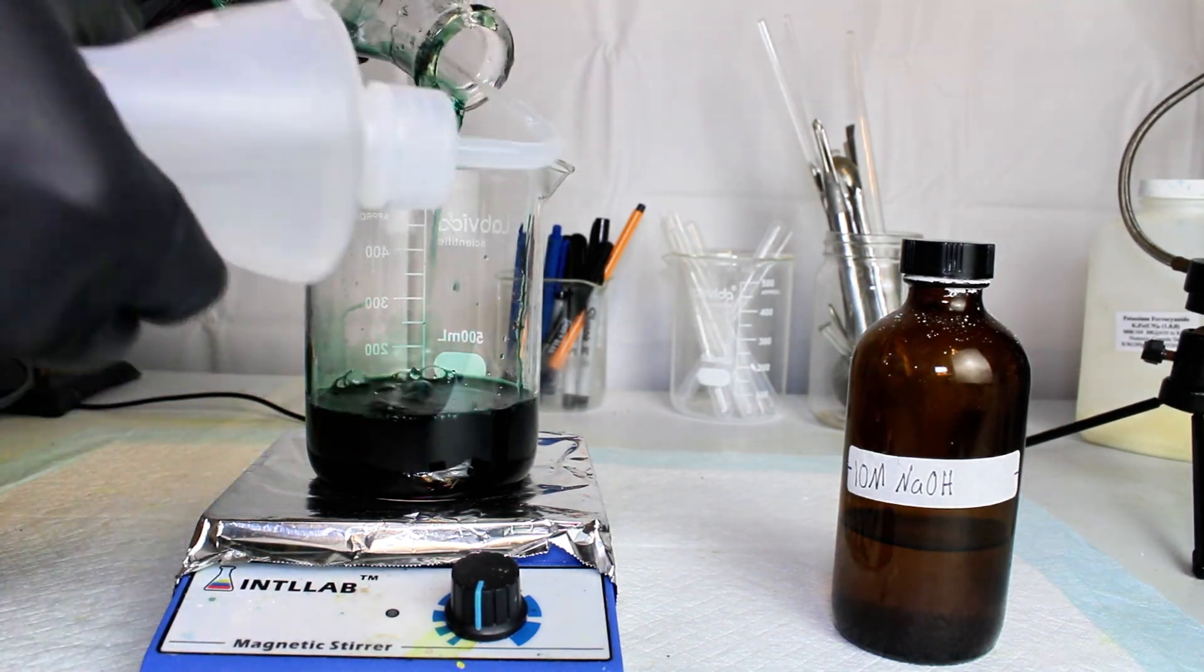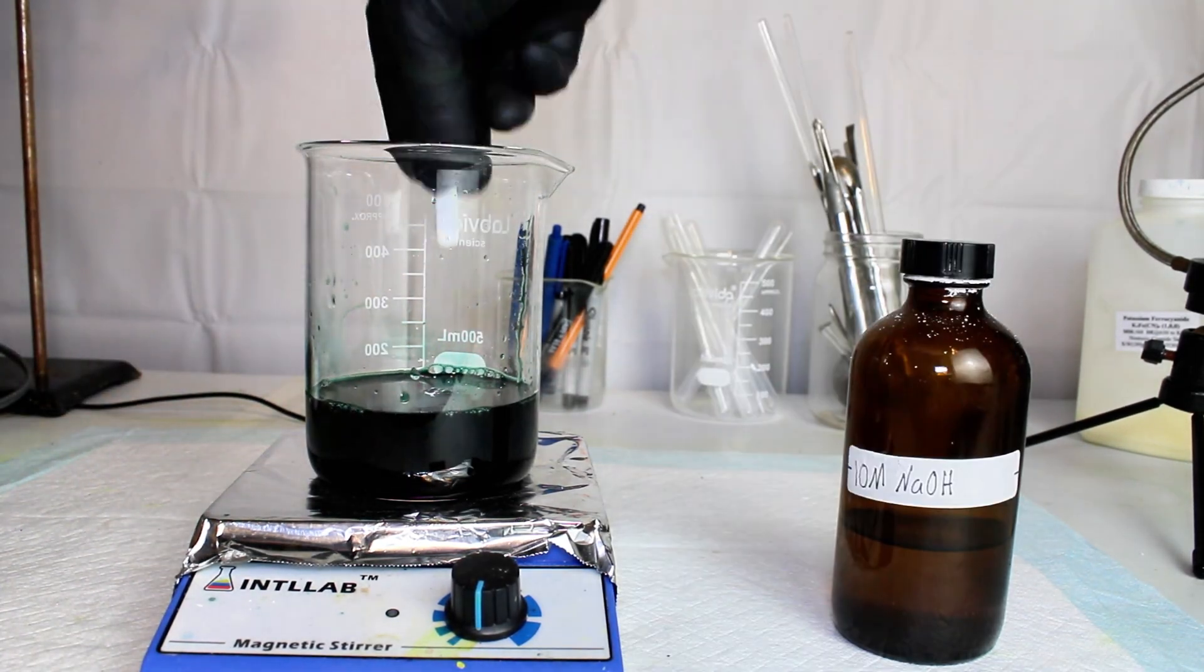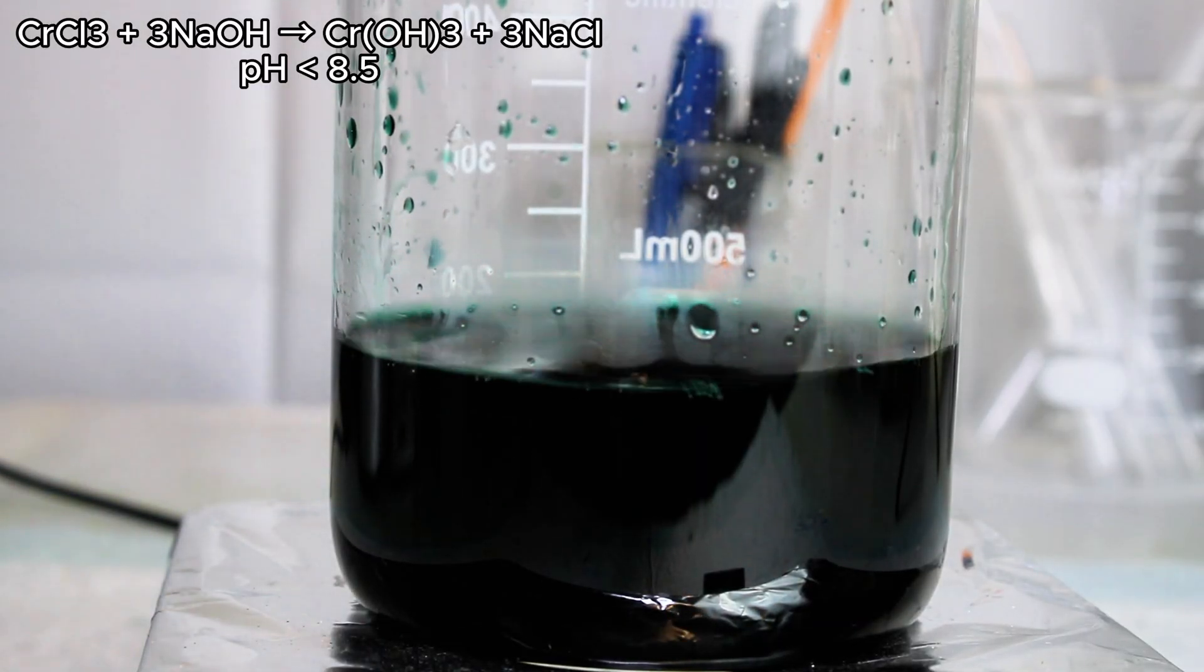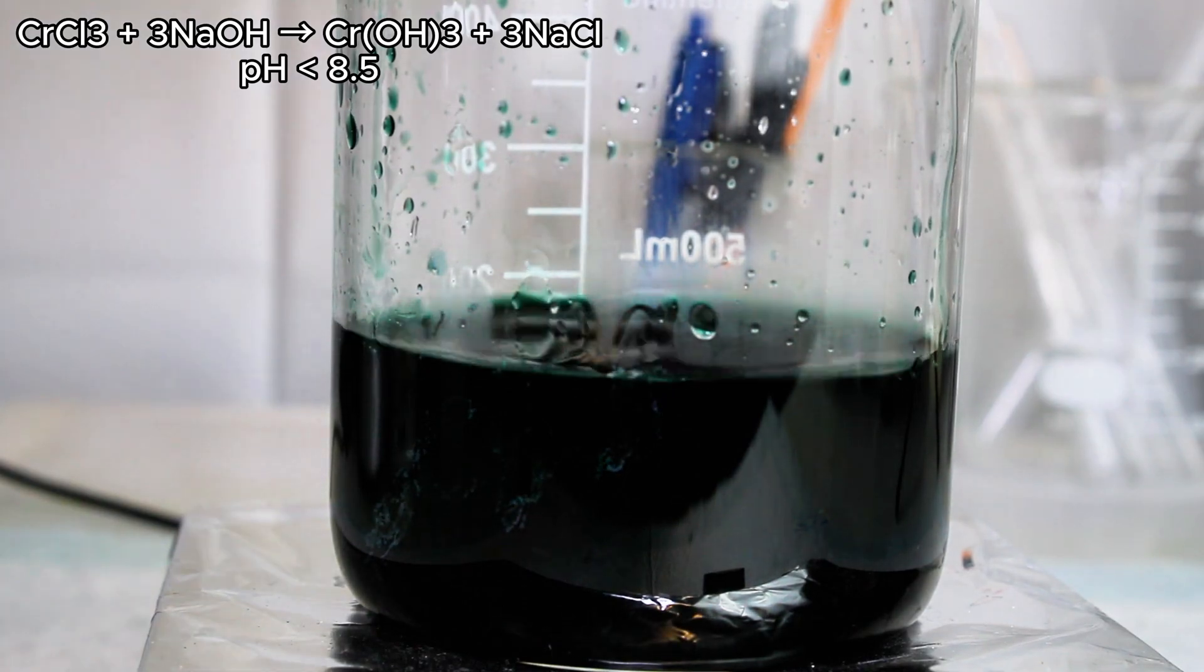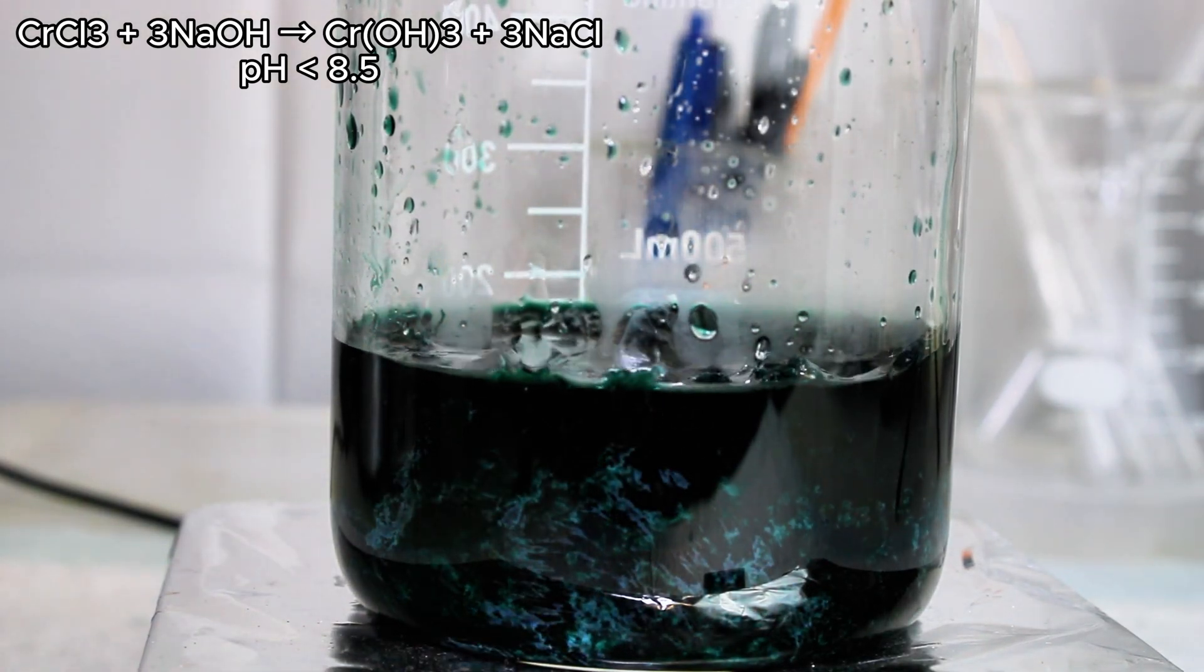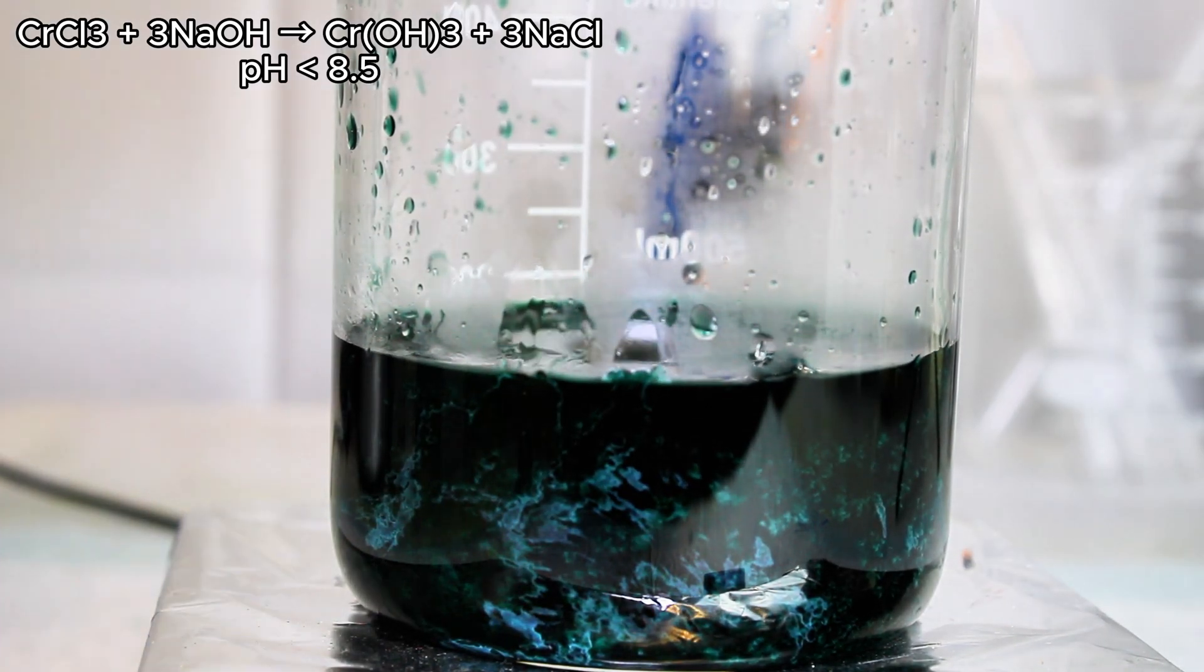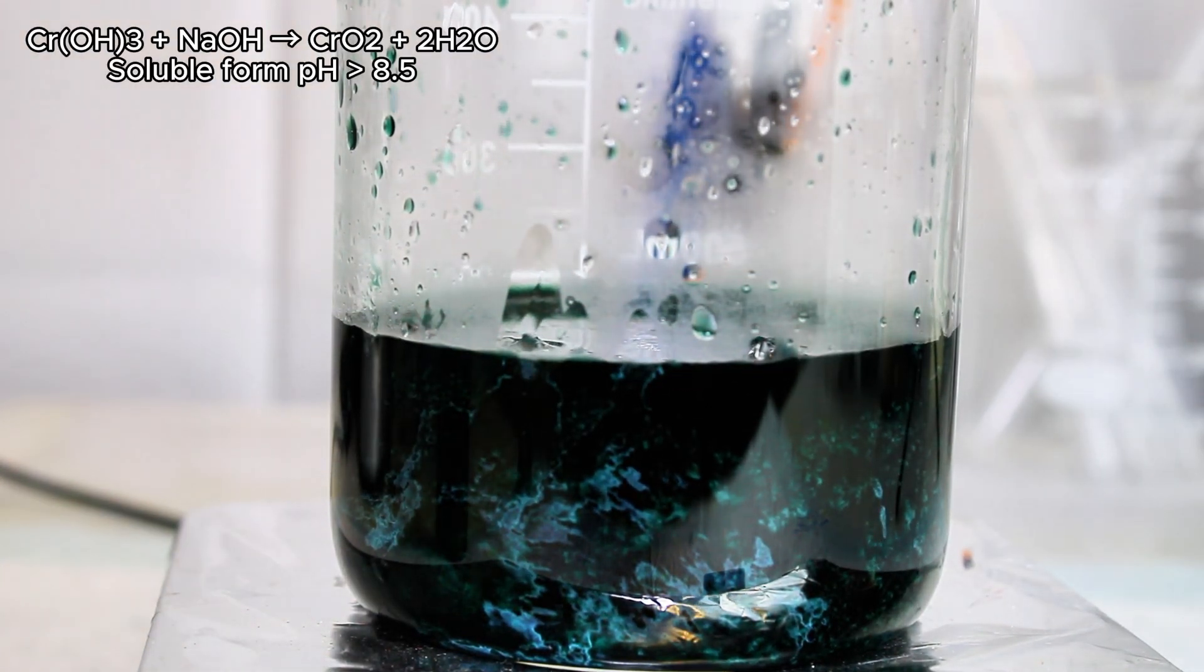The next step was to neutralize the chromium chloride with sodium hydroxide to precipitate chromium hydroxide, which is completely insoluble and can be filtered off. Now it is important here not to exceed a pH of around 8.5, as chromium is amphoteric and will redissolve in excess hydroxide.